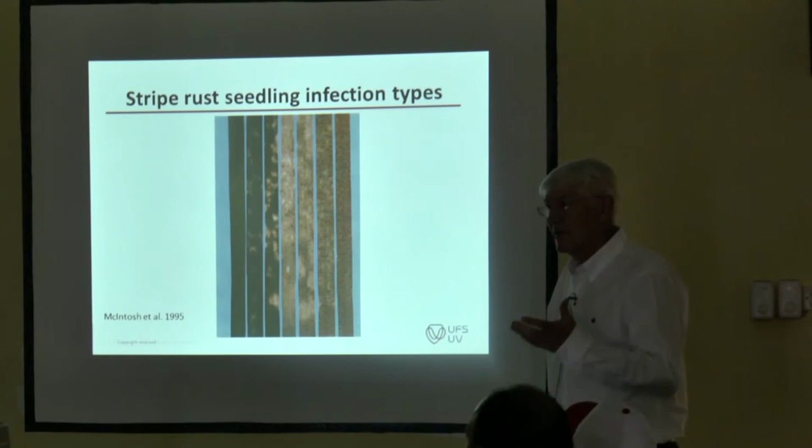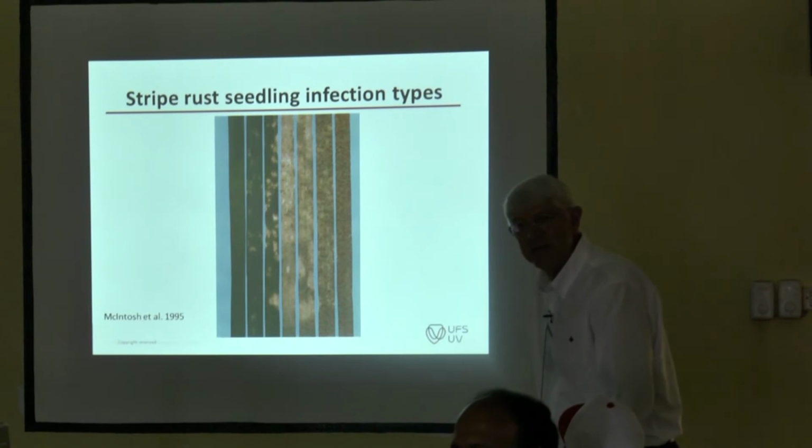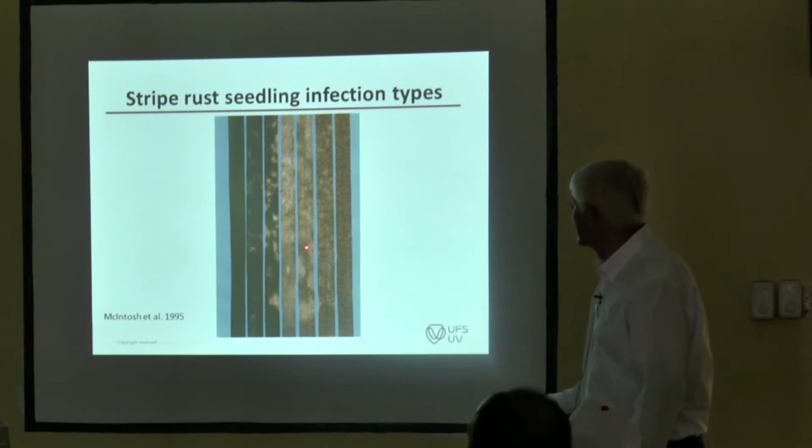Yes, you must also know the phenotype of the individual genes. And you need to know the phenotype. And then we also have other differentials with the same genes, like Avocet YR17 and VPM. Sure. And we compare, so like VPM gives this one, we term it 6 on our scale.